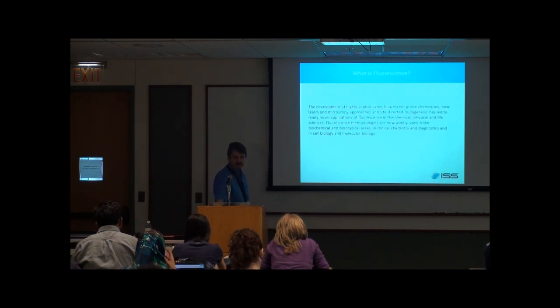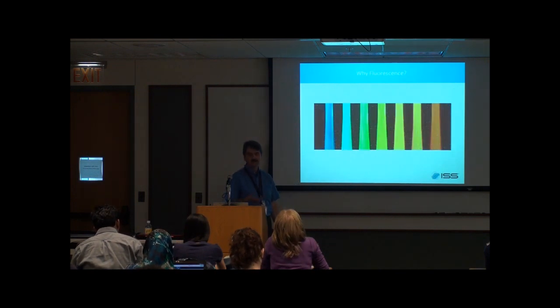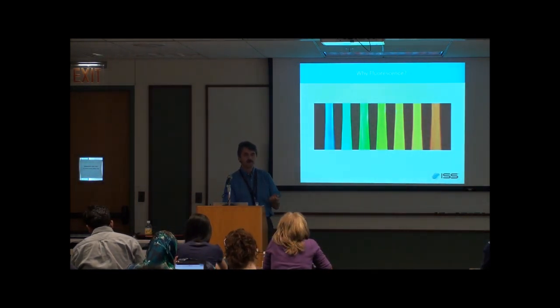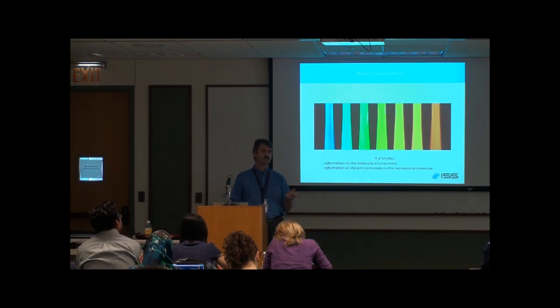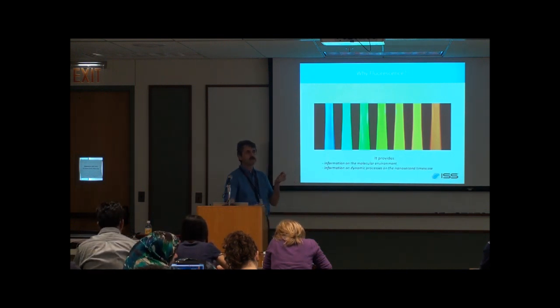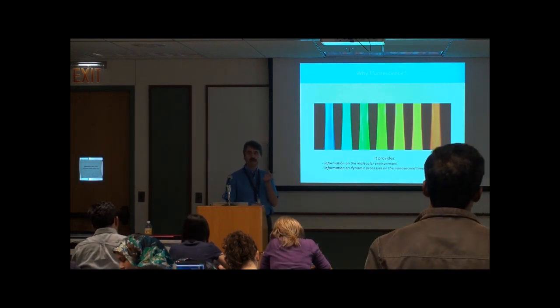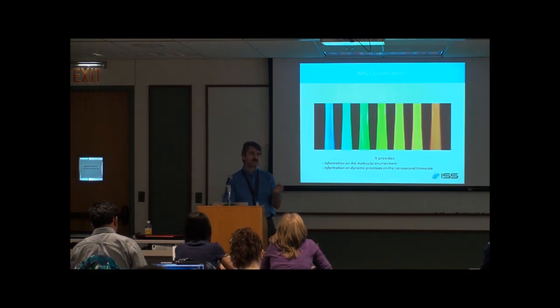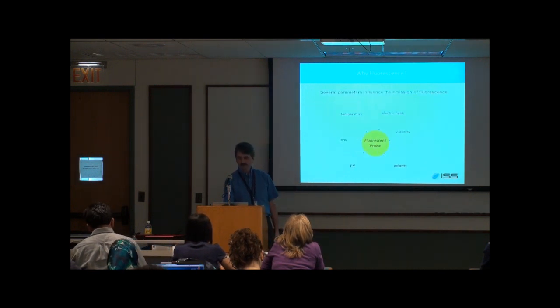Well, fluorescence became important in the last few years, partly because of the availability of lasers, the availability of chemistry probes, and the availability of instrumentation. Why is it important? It is important because we can use it to understand the environment of molecules. We can use it to understand how some processes occur on a very short time scale, all the way from the microsecond all the way down to the picosecond scales.